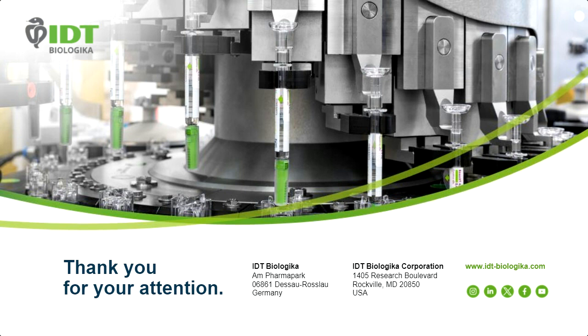This attendee would like to know, how do you handle waste air and heat in a clean room from CO2 incubators? Thanks for that question. We have CO2 incubators in our rooms, up to 6 within. We have an active air supply within the rooms and active control of our temperatures. So waste air and heat from our CO2 incubators is not an issue for us because of the fresh air supply to our rooms.